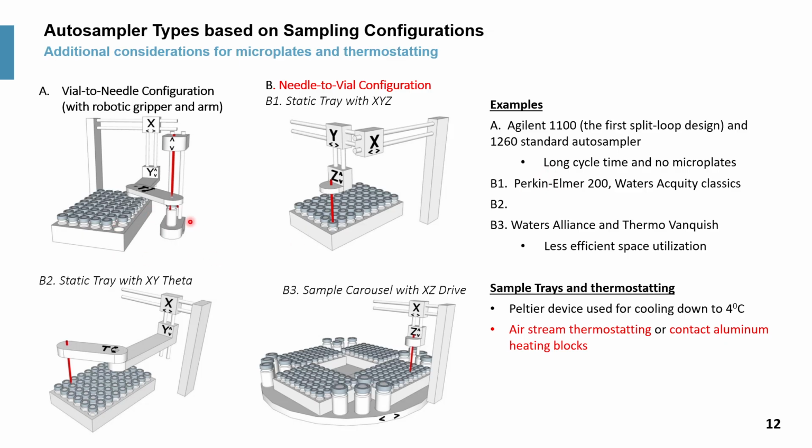So here we have a robotic arm, which is kind of slow, but you have a three-finger gripper, which brings the vial to underneath that sampling needle, right? And the high pressure sampling seal is positioned right underneath the needle, right? So you bring the vial to the needle.